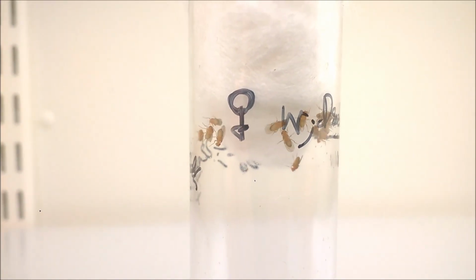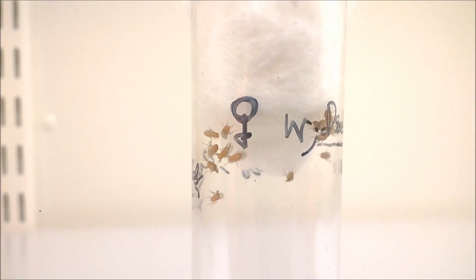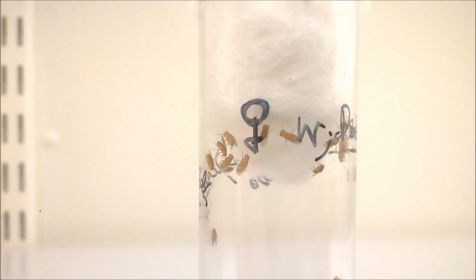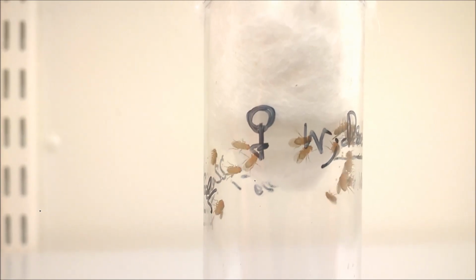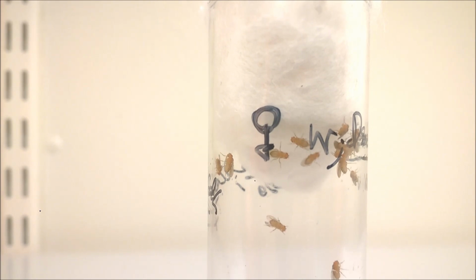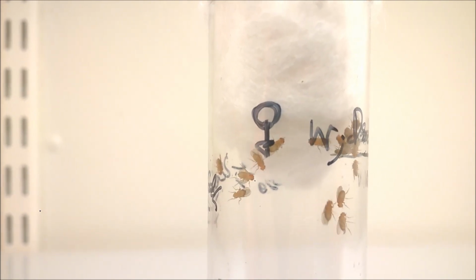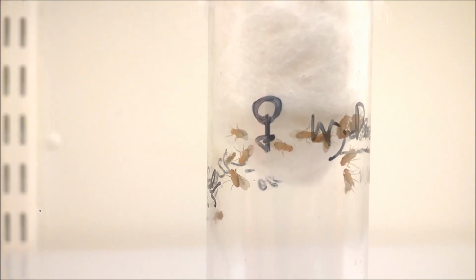After crossings, females will be selected to be subjected to single sensillum recordings. The motivation by which we choose females is because of several phenotypic features to our advantage, like bigger dimensions, which make it easier to manipulate the insect, and also bigger antennae and softer sensilla for recordings.